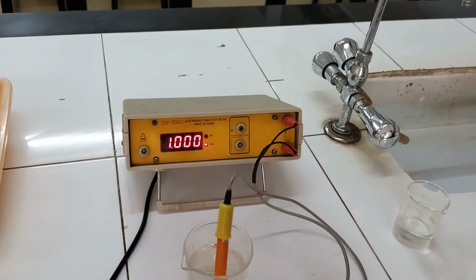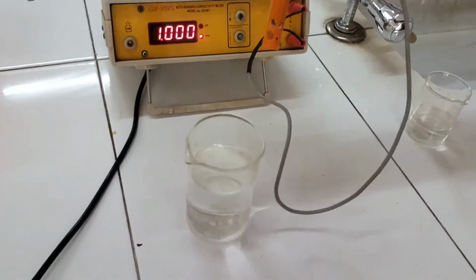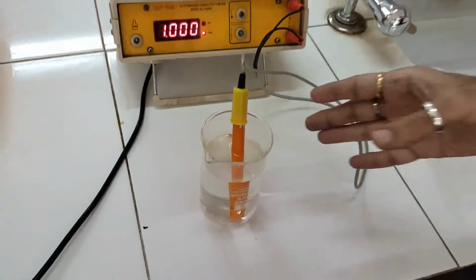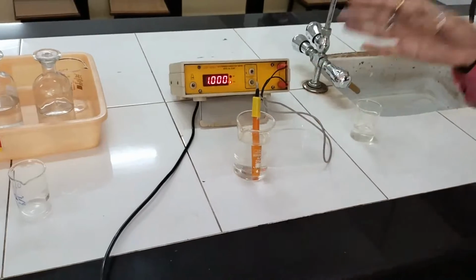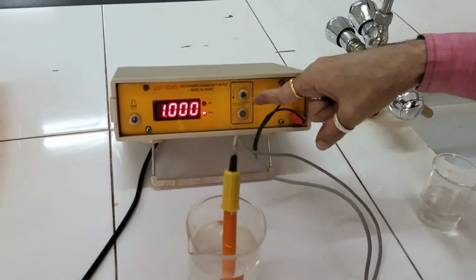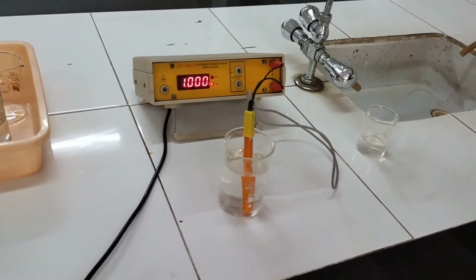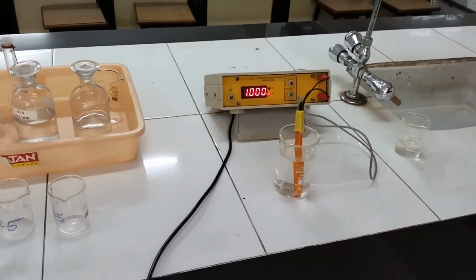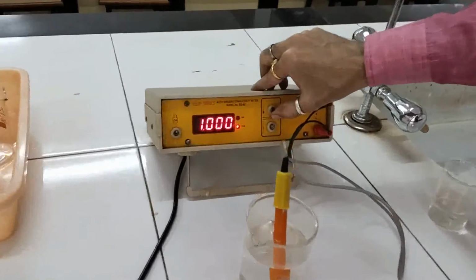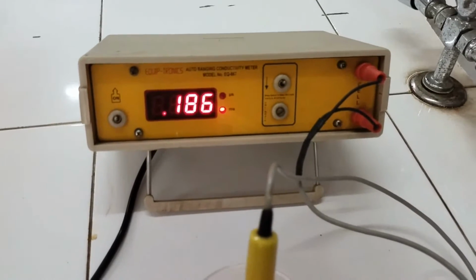While taking the readings, first of all let me tell you, this is a conductometer cell. This is a beaker containing conductivity water. As I had already mentioned in the theory part, during conductometer experiments we make use of conductivity water. So the electrode has to be placed in the conductivity water, in the downward mode, and it should show 1. So this is standardization. I hope the standardization part of this instrument is very clear to all. Now when you have to take the readings, we have to lift it up this way. This should be the mode while taking the readings.